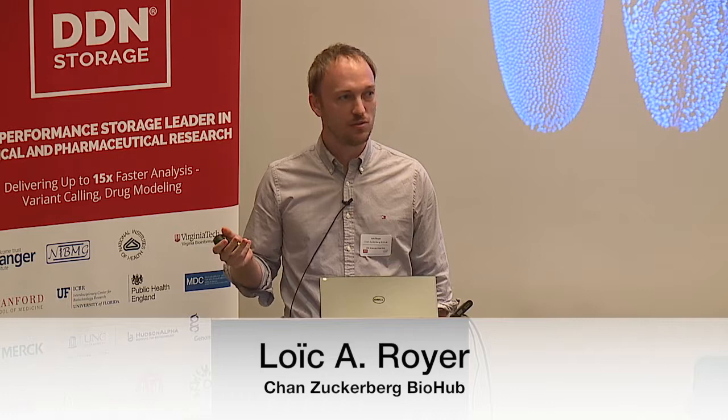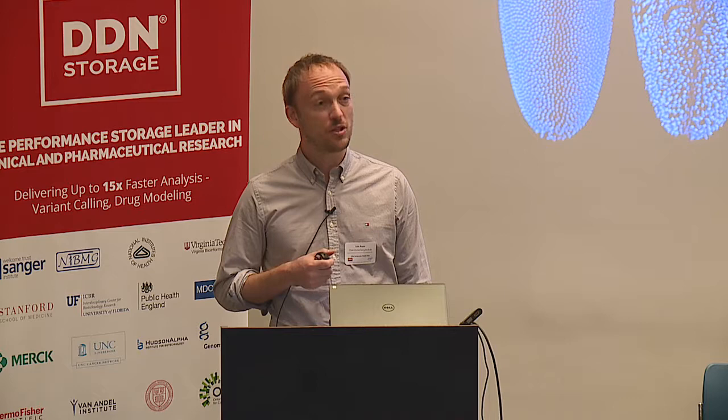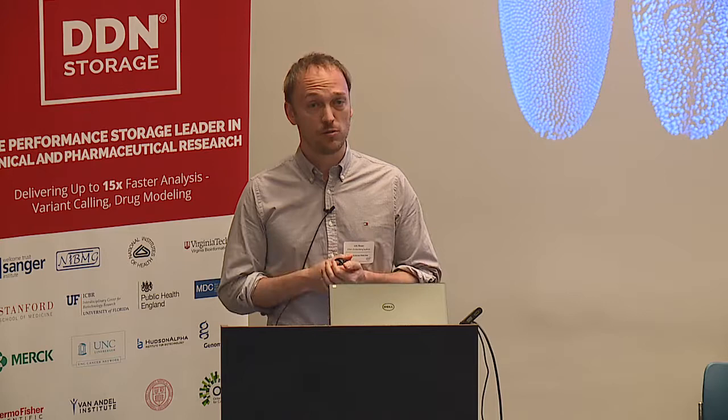I'm going to switch gears a little bit to imaging. As was hinted before, imaging is becoming a very challenging field for storage also, I guess. I'm a group leader at the Biohub in San Francisco. What we do is we build light sheet microscopes, which are devices that let you observe a living organism in its totality over time, so you can really observe a developing embryo at cellular resolution without trouble. And that, of course, produces a lot of data.